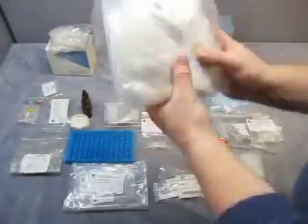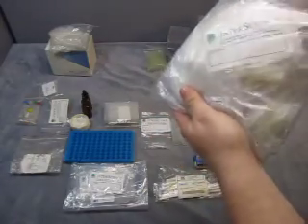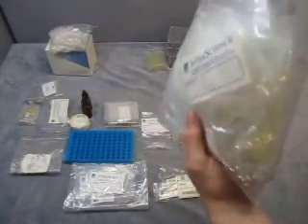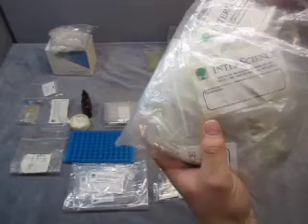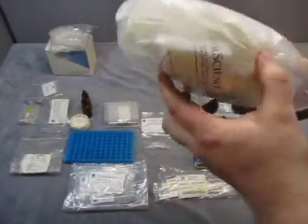Then you get a whole bag of these — yellow tips, 1200 µL, package of a thousand, though there's not a thousand in here. I think there's some clear ones too. There's all kinds of different tips in here.